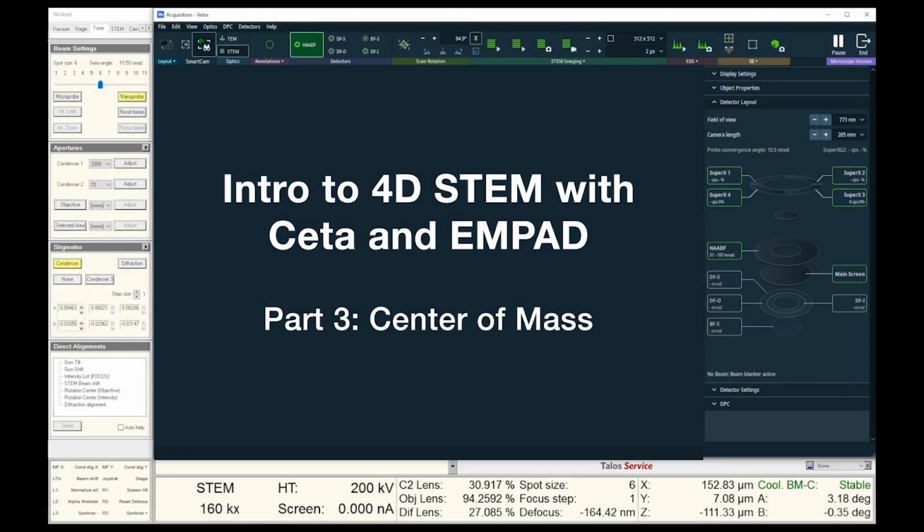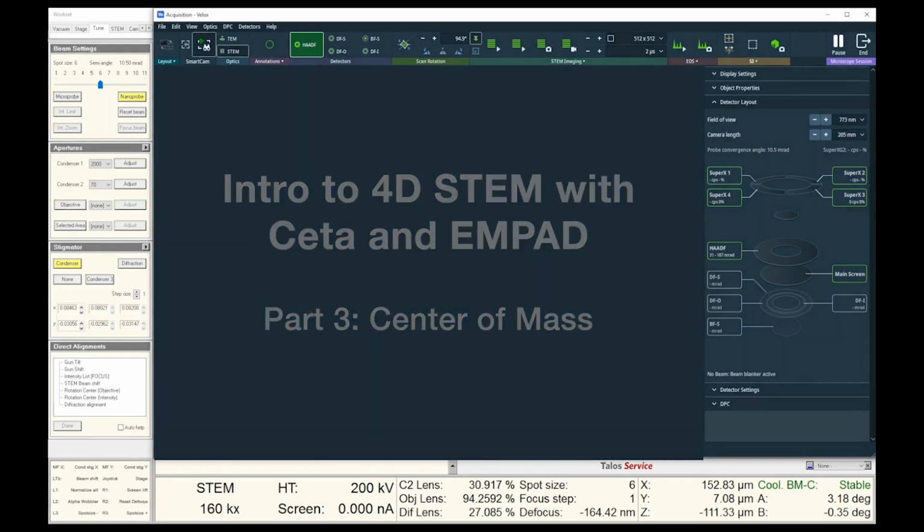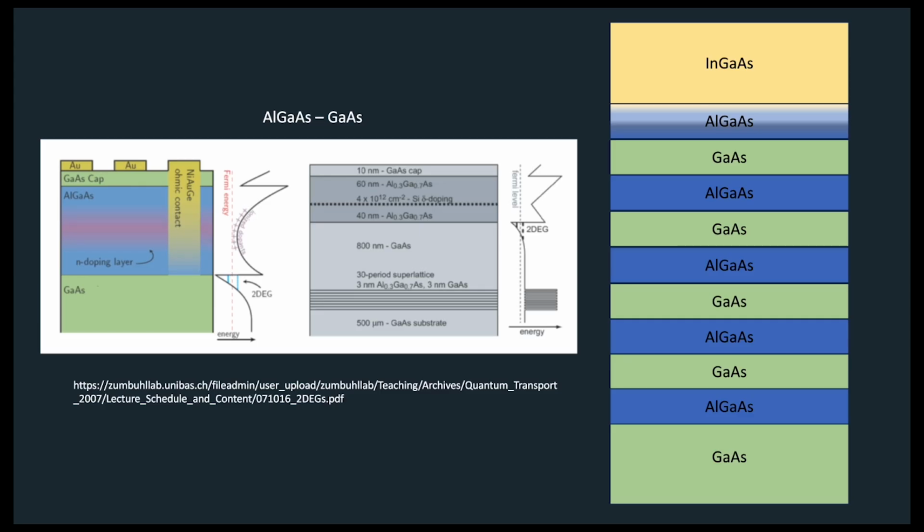Welcome to our tutorial on Center of Mass 4D-STEM data acquisition. Today we'll explore not only the experiment setup and acquisition process, but also the fundamentals and applications of this advanced microscopy technique. Before we start, I would like to give a brief overview about the sample.